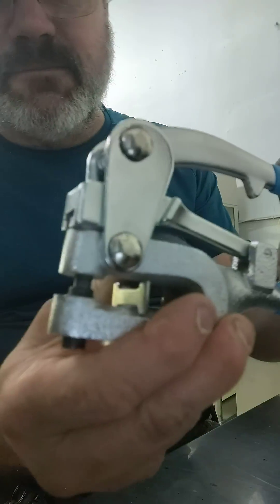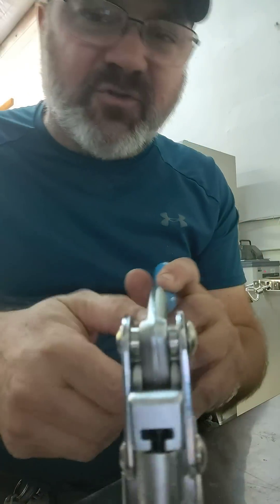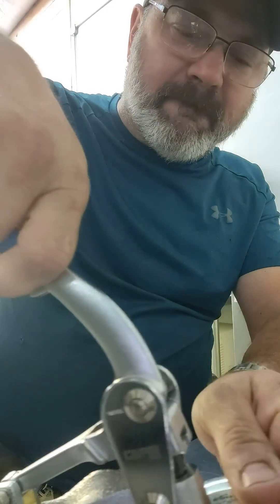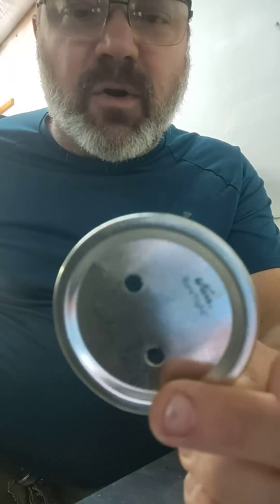You can see it's got a lever and a jaw and it's going to punch a hole there. I'm going to show you how easy this is — it's going to make you throw away your drill. Just pop. And there we've got two nice clean quarter inch holes.